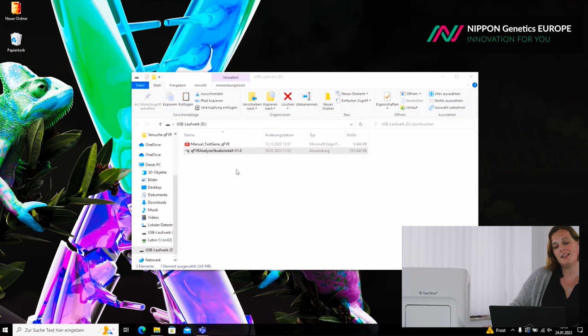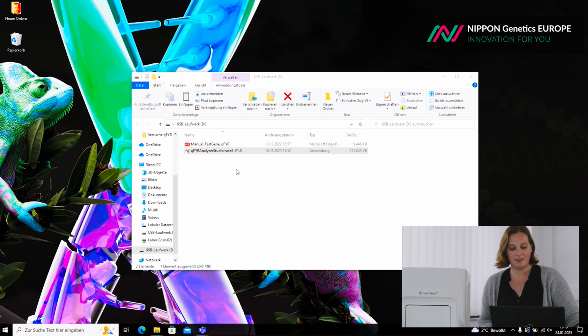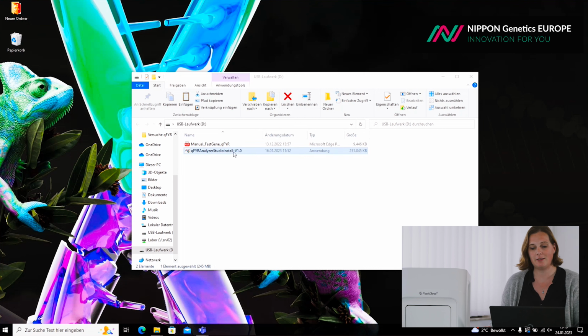In today's webinar, we are going to demonstrate the qFYR Analyzer Studio. So let's start with software installation. The software installation file can be found on the included USB flash drive. Open the file by double-clicking and execute the software installation.